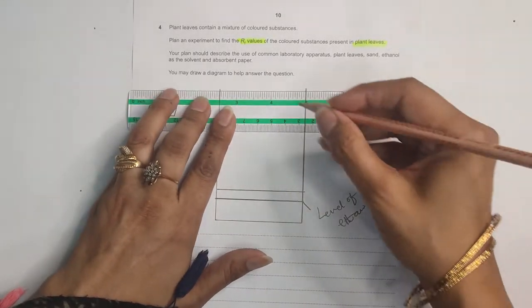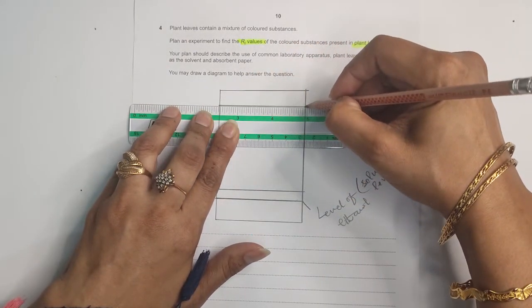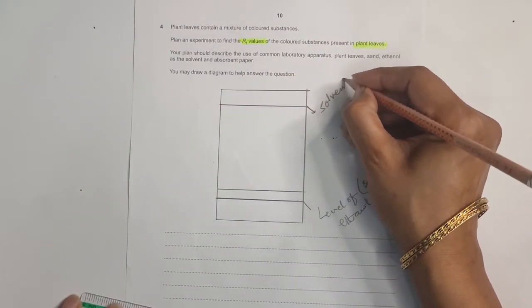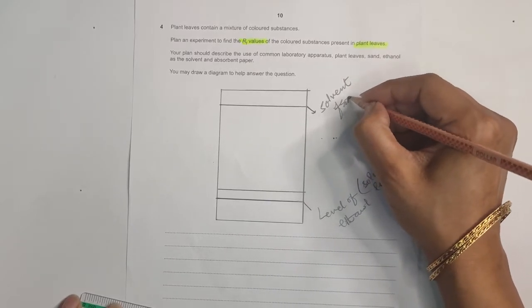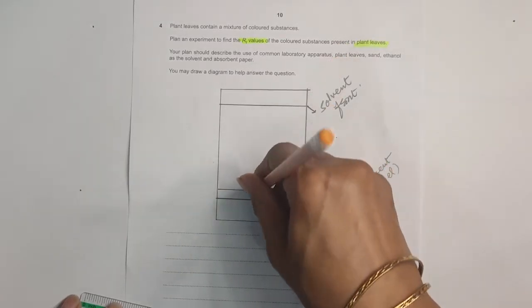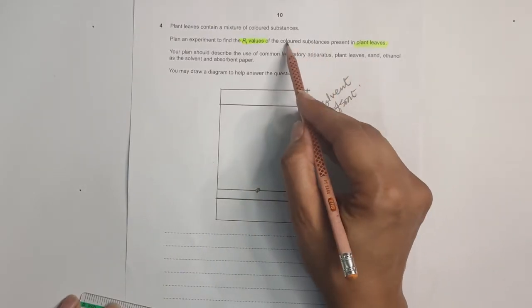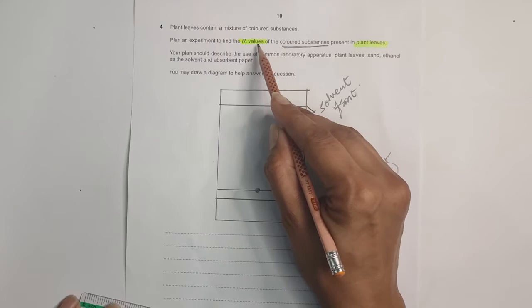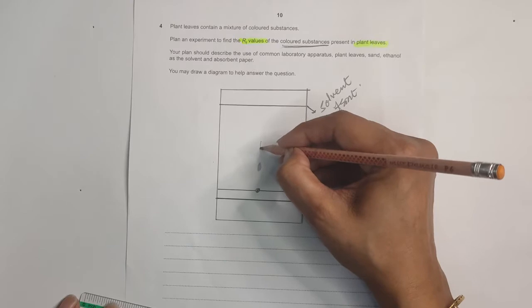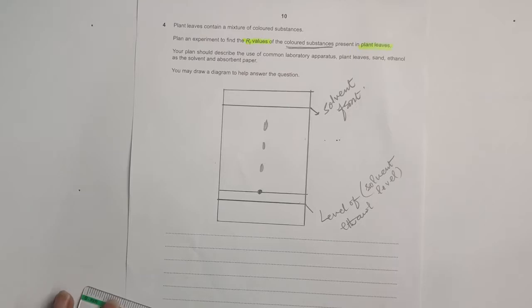Then after that we will draw a straight line over there. Another line is here, and this one is our solvent front. Here we will put the mark. We will take our extract and place it over here, and we will check how many colored substances there are and their RF values. For example, it is going to form one spot here, one spot here, and one here. We can calculate the RF value for each as well.